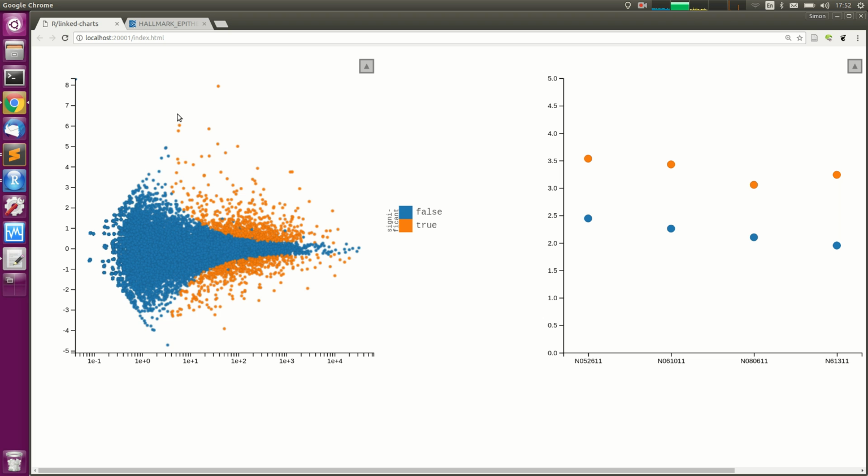So this is something which is called empirical Bayesian reasoning, which is a big word for just saying you first look over all your genes to see which kind of fold changes actually happen. And if we assume that these are all exaggerated here, then we can say actual fold changes sit in sort of this range, and they never go much beyond that. And if now a gene is up here, we should only believe it if it really has a low uncertainty. But if the range of plausible values given by its standard error reaches all the way down there, we should probably take rather these values.